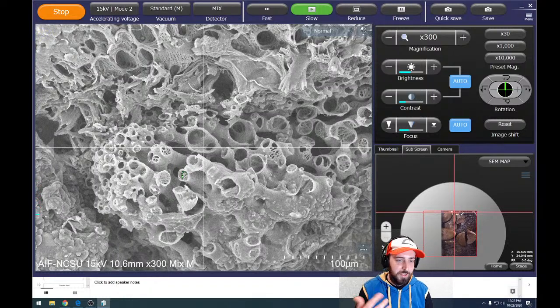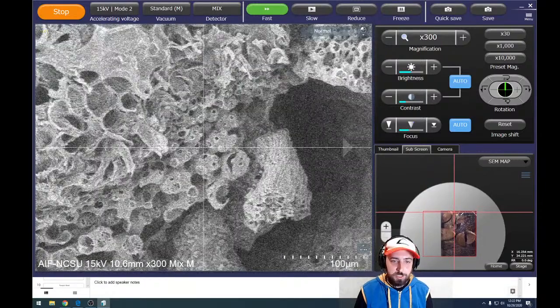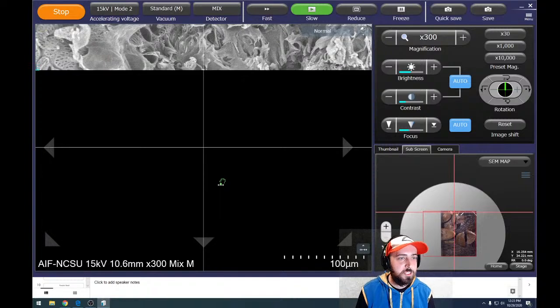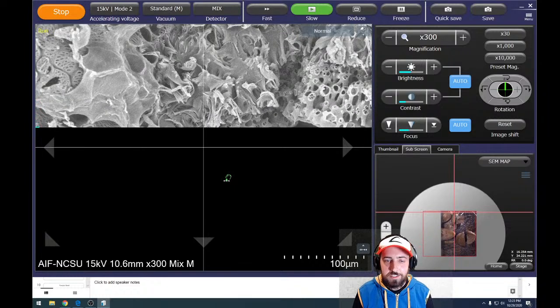The word that I wouldn't have thought to describe it as at first, but after I heard it or read it, totally made sense. It looks kind of spongy. It looks like what a sponge looks like, where you have holes in a network of different things. And I swear yesterday I saw a face somewhere in here, and I'm going to try to find that face again because it was kind of spooky. I'm sure if we sit here and look enough, we'll find a face again, but we won't spend too much time. But this was a pleasant surprise. I wasn't expecting to see anything like this when I put this sample in.